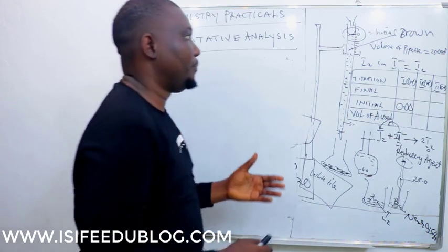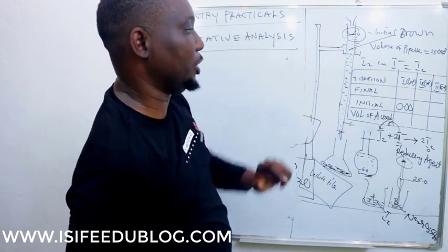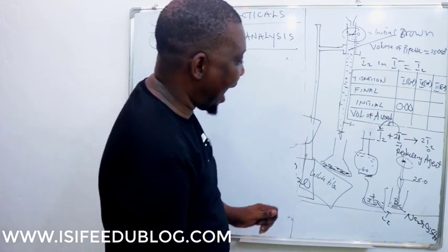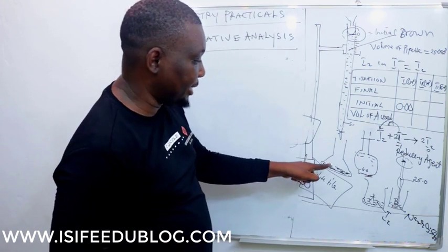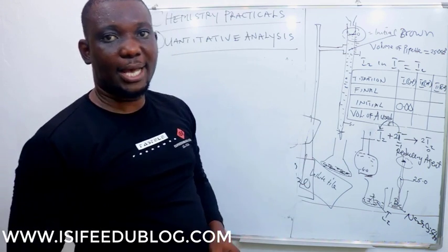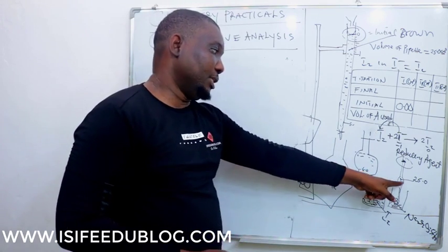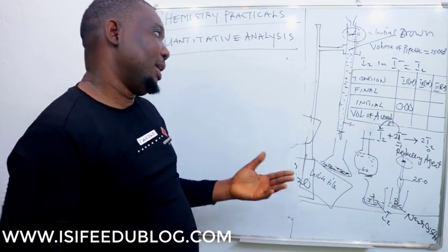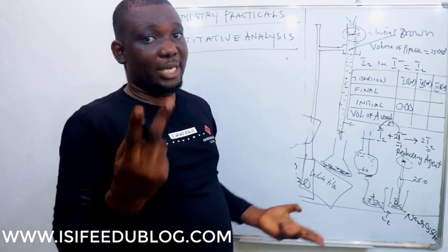Now we've been able to pour the acid. I've already known my initial reading. So what I will do is, I will not add any indicator yet. I have to titrate. It's not like your acid-base titration where after emptying the content of the pipette here, you add 2 drops and observe color. No, in this titration, you have to titrate 2 times.